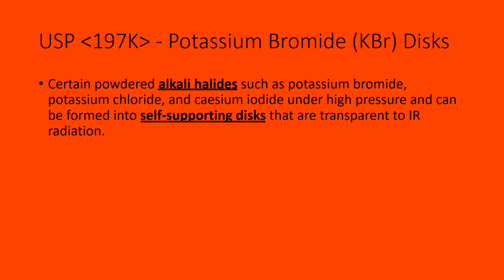Always use analytical grade reagent potassium chloride or potassium bromide for better results. It should be pure and dry. Then you get a nice transparent disc.